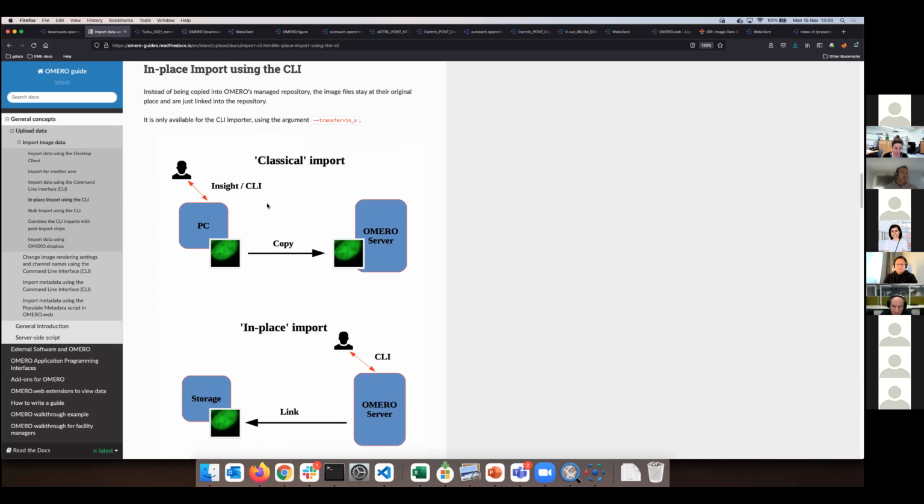Yes, well, thank you very much. So all that is described is in the guide. There's various options, and Peter will show you how to switch it. But there's another question from Sarah. Well, she has raised her hand.